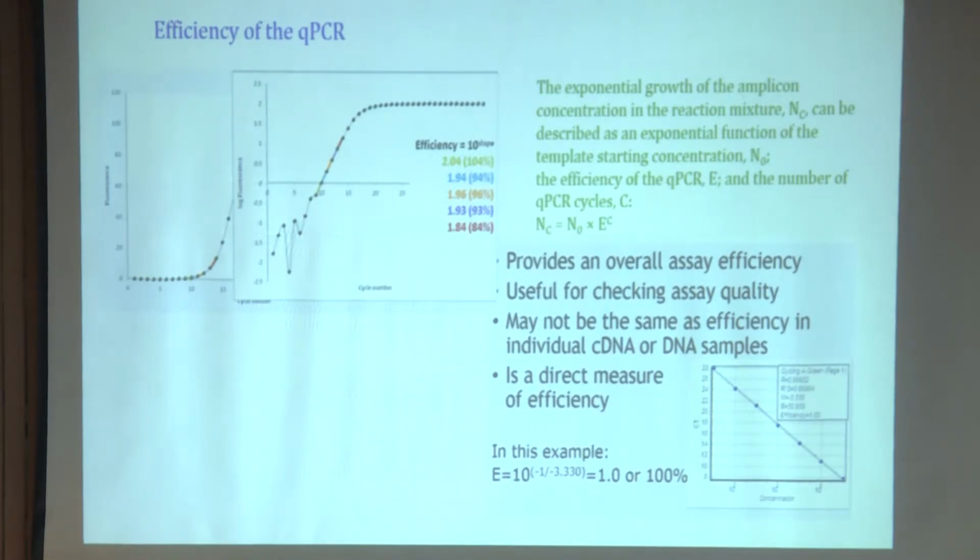But within the 20 microliter in your reaction, we have a lot of limitations. One is you may not have sufficient number of dNTPs, or you may not have the enzyme, or sometimes you may run out of it, or the reaction may run out of it, or you may have some kind of inhibitors which are present in the cup.